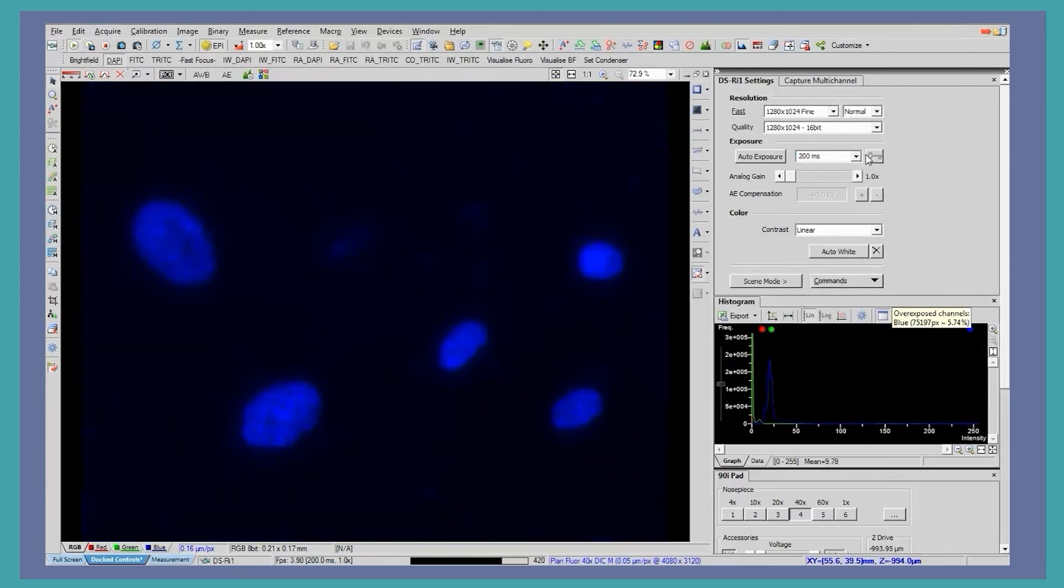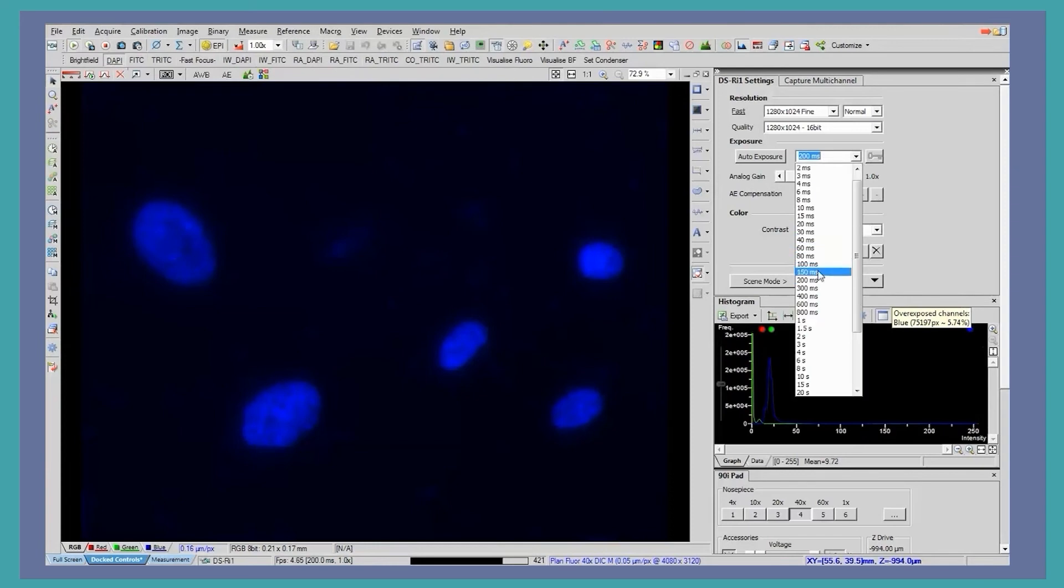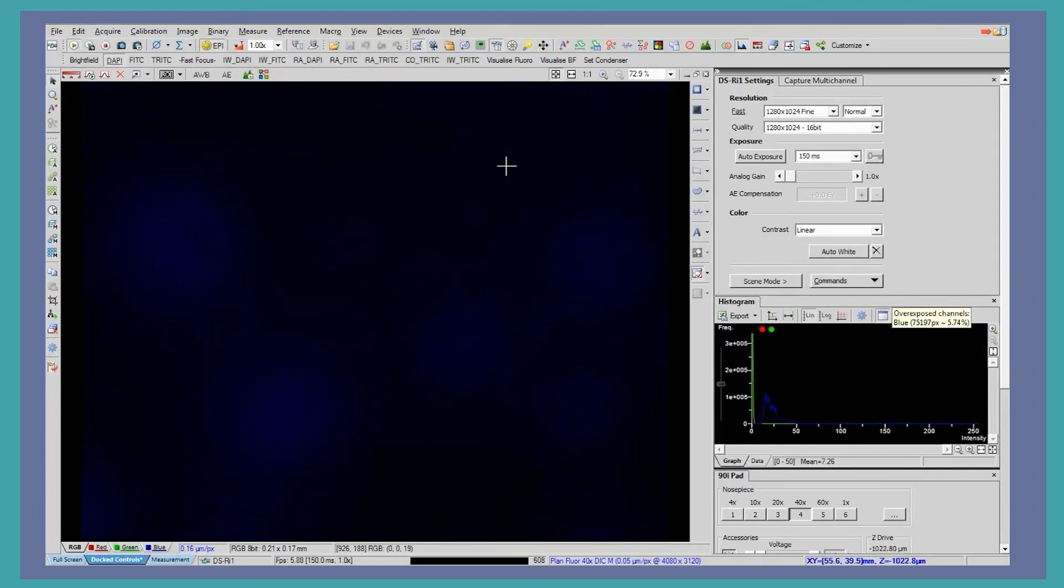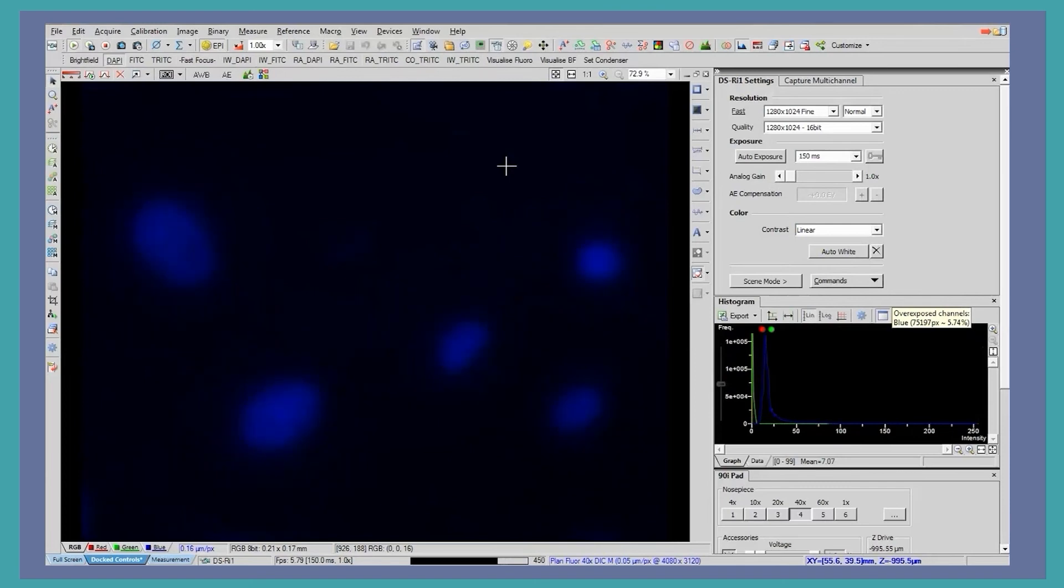Once you are happy with the exposure settings, it's important to adjust the focus. Adjusting the focus time changes with the higher exposure that you apply to your image. Higher exposures such as brighter images will take longer to bring into sharp focus. If you are using multiple fluorescent tags, it is important to check the exposure on each channel.